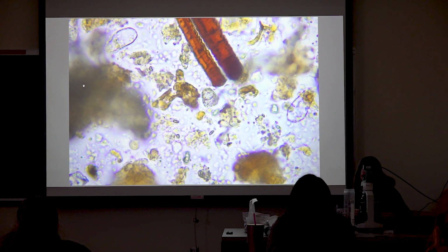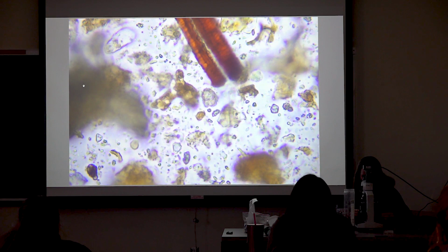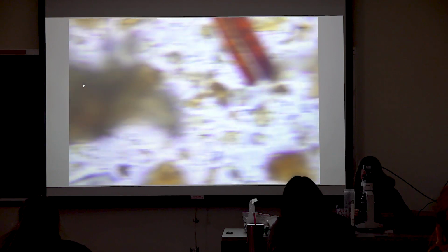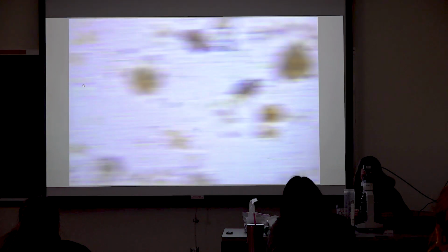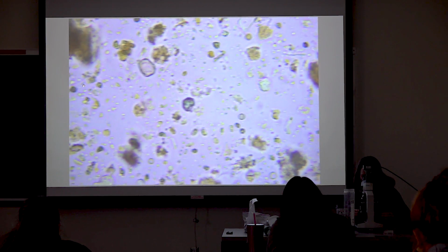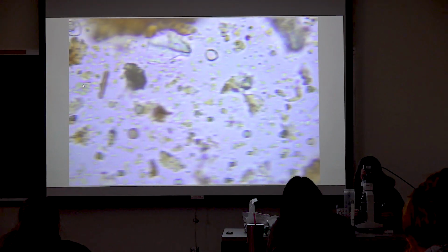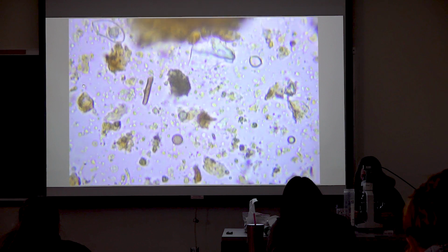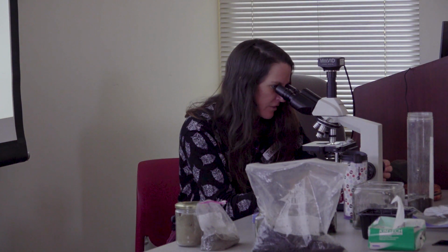It can be really challenging to distinguish every single bit of food waste and stuff that's in your compost. So a lot of what we're looking for when we're looking for microorganisms is these very smooth surfaces. There aren't a lot of materials as feedstocks that you're going to put into your compost that are going to be smooth and rounded. So that's a really good indication that you're looking at living things.